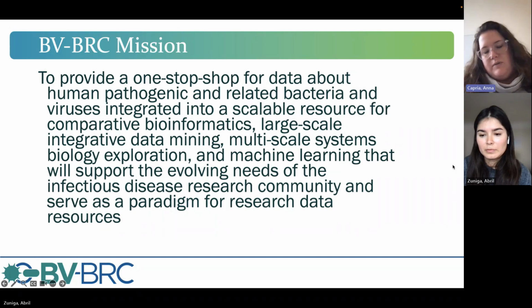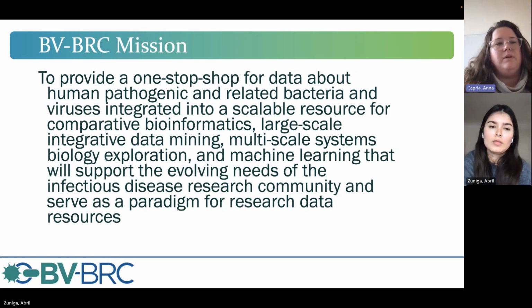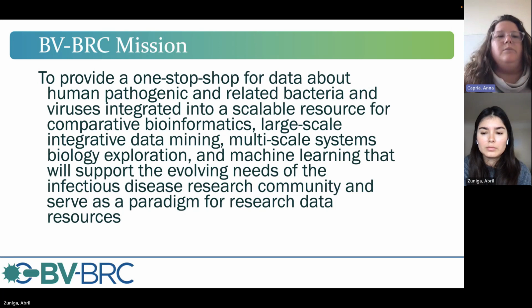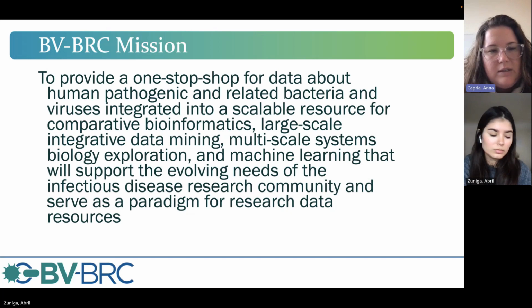So over the course of this Back to Basics series, we've covered the data as a whole, our phylogenetic tree service, and the sequence annotation and assembly. So just really kind of getting you comfortable with some of the core services that the BV-BRC offers. And those recordings will go up on our YouTube, and you should be able to access those. So that's kind of a high level what the BV-BRC is.